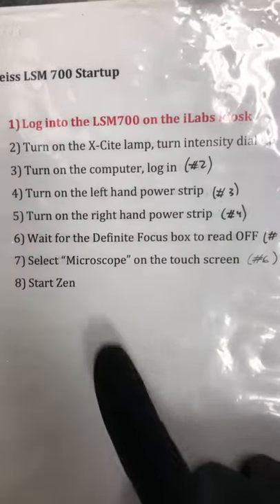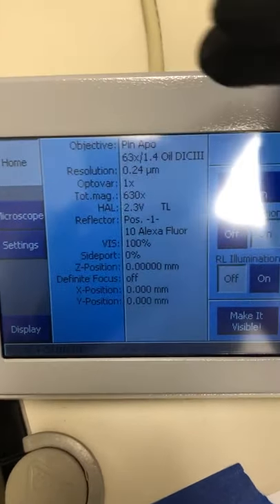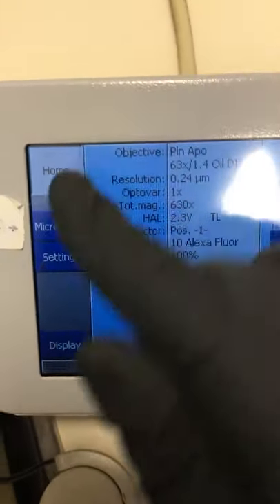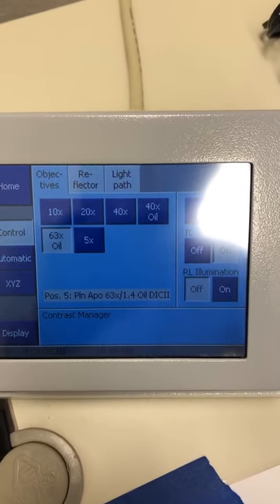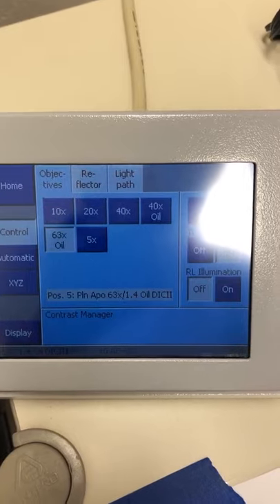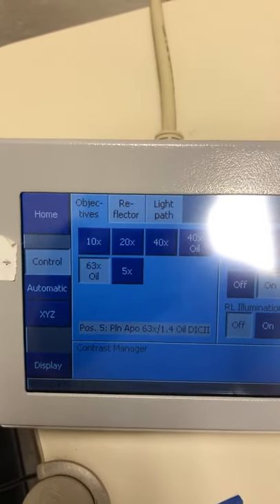The next step is to select the microscope on the touch screen. Here's the touch screen — the default panel isn't very useful, so we press this microscope button. That gives us a list of objectives which allows us to change objectives by clicking around, which is more convenient.